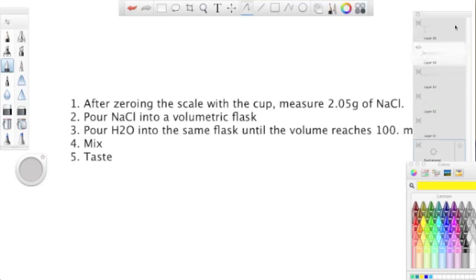So after zeroing the scale with the cup, we measured 2.05 grams of salt. Then we poured it into a volumetric flask. Next, we poured water into the same flask until 100 milliliters.